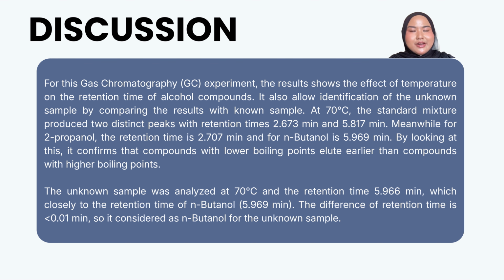Hi, my name is Mara and I would like to talk about the discussion of the GC experiment. For this gas chromatography (GC) experiment, the result shows the effect of temperature on the retention time of alcohol compounds. It also allows identification of the unknown sample by comparing the results with the known sample.